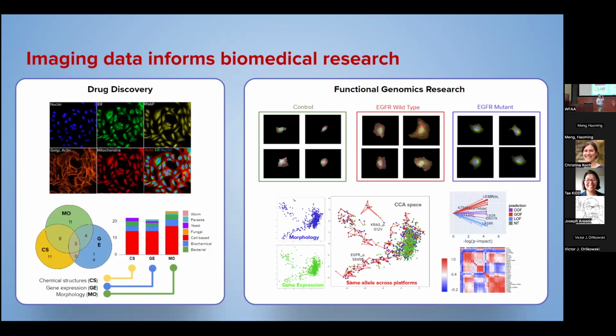That generates a bunch of images that, again, nobody is going to look at manually, and we need computational methods in order to transform all that amount of images, which is like observing the microscopic universe and what's going on with the cells, and then interpret what happens at the cellular level in order to tackle some of the most pressing biological experiments of our time.